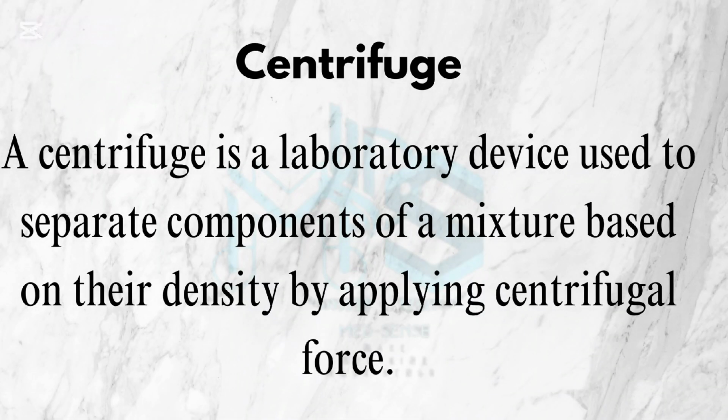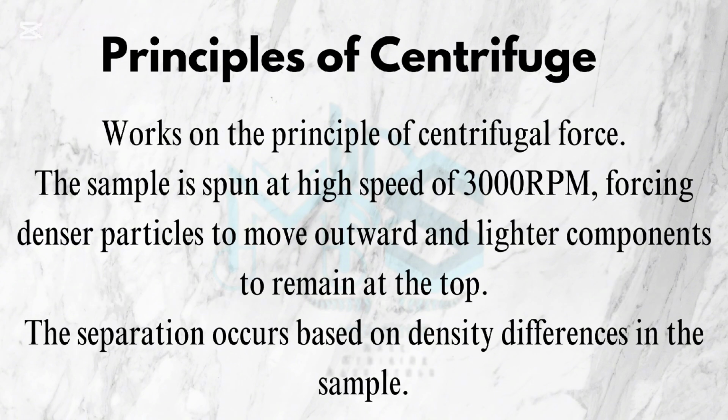A centrifuge is a laboratory device used to separate components of mixtures based on their density by applying centrifugal force. So they will always make reference to this centrifugal. Questions will always revolve around it. Maybe in objective questions, you will be seeing things like, is it by applying centripetal force or centrifugal force? Don't forget centrifugal force. Principles of centrifuge: it works on the principle of centrifugal force. Again, it has been reiterated.